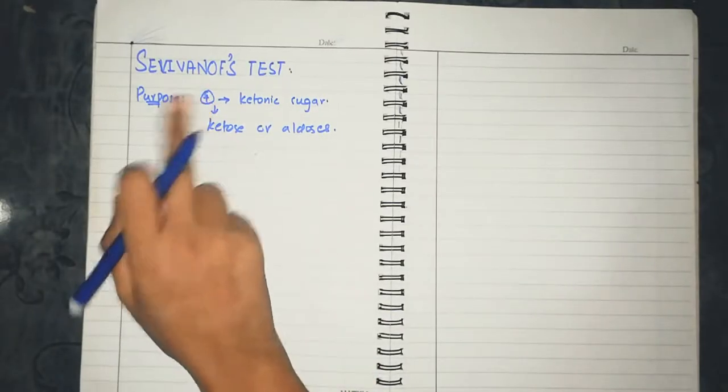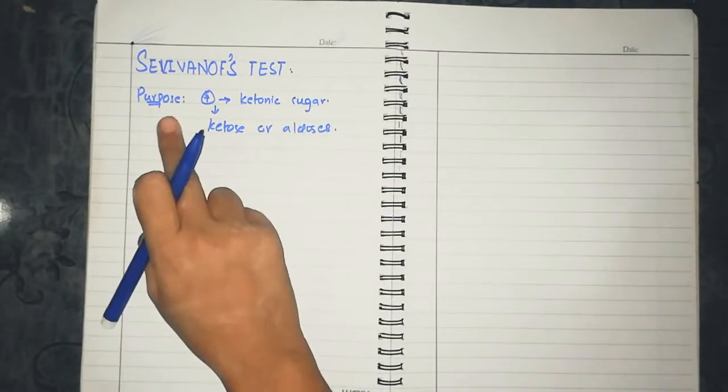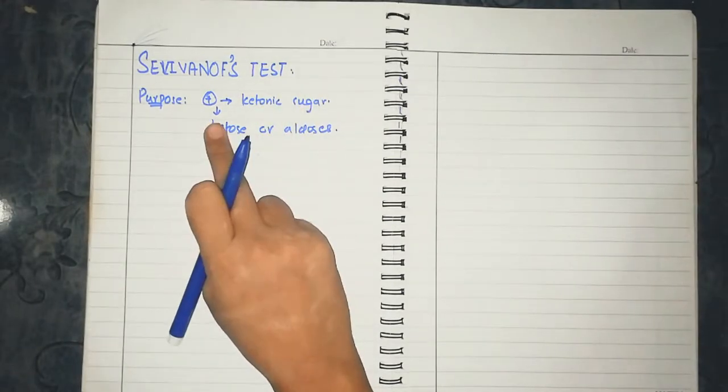Assalamualaikum students. Today we have to look at the Selivanov's test. First of all, this test gives us positive results for ketonic sugar.